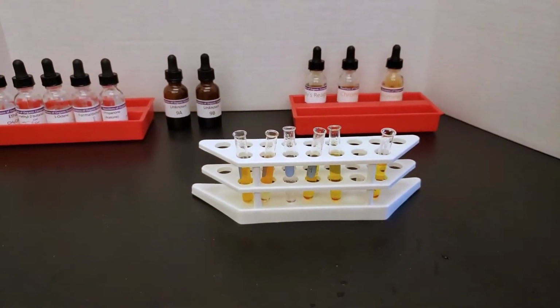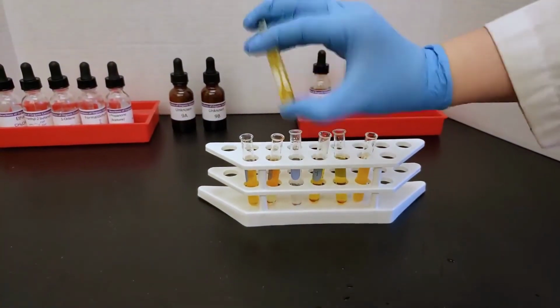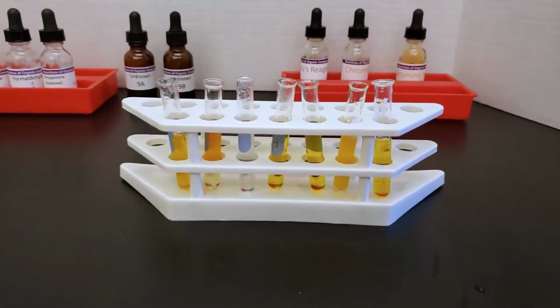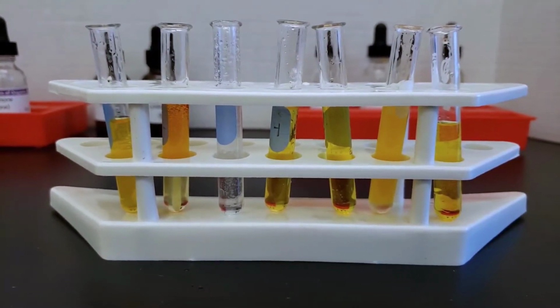The rest of these will shake up and will confirm that there are no carbon-carbon double bonds in any of the other chemicals. From right away, we can pretty much tell neither of our unknowns is octene.